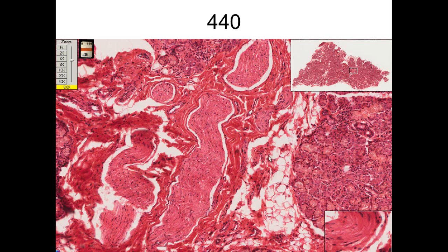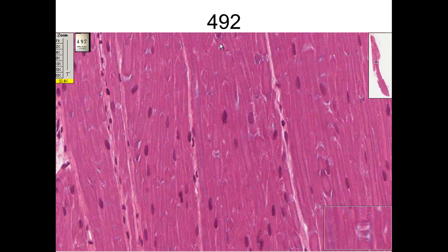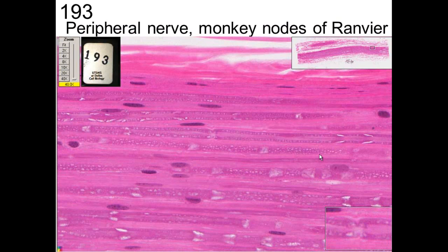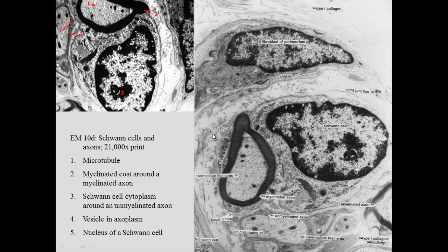We can see the perineurium going around each of these, which is the blood-nerve barrier. In this slide we can see myelinated axons, and this is the cleft between two adjacent myelin sheaths. In a myelin sheath the Schwann cell wraps around the axon, so this is a node of Ranvier, as opposed to the Schmidt-Lanterman clefts that run at an angle. You can see the axon going down through the center, right beyond the node of Ranvier.